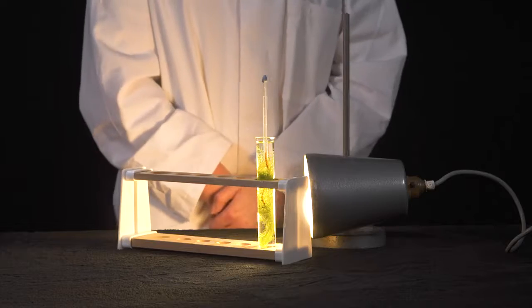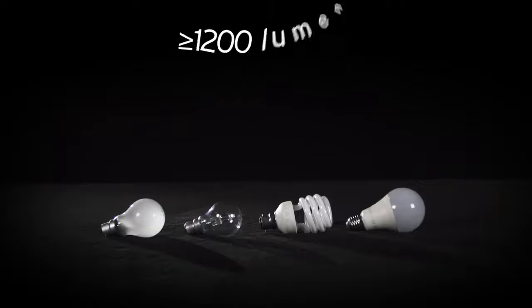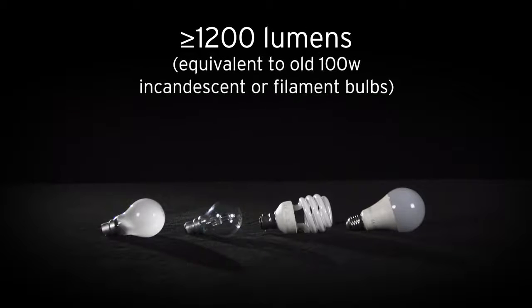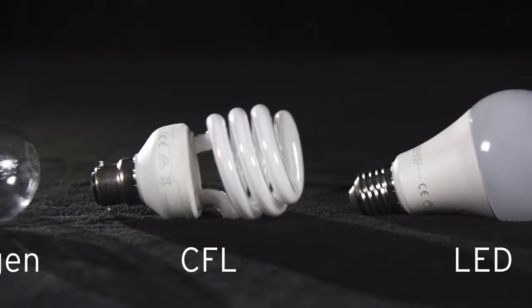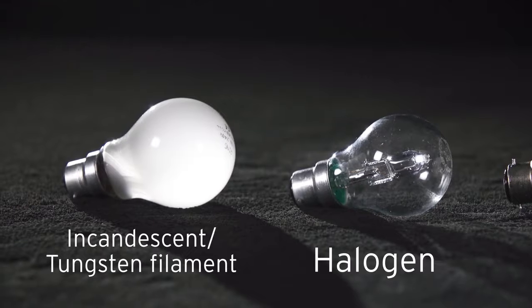For all photosynthesis practicals, lighting is key. Here at SAPS, we recommend using light bulbs brighter than 1200 lumens, which is equivalent to a 100-watt incandescent or filament bulb, for all photosynthesis practical work. There are a wide range of light bulbs available. If you're buying new ones, lumen rating is the best thing to look at on the box to make sure that a bulb is bright enough for photosynthesis. You can use any type of light bulb as long as it is bright enough.